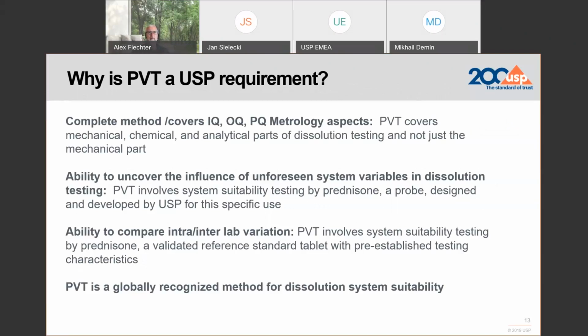It's also an ability to uncover influences of unforeseen system variabilities in dissolution testing. The PVT does all that for you. Ability to compare intra- and interlab variations. You can use PVT to do that. Method transfer, for example, if I want to mention just one way of doing it.